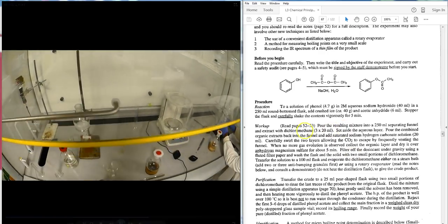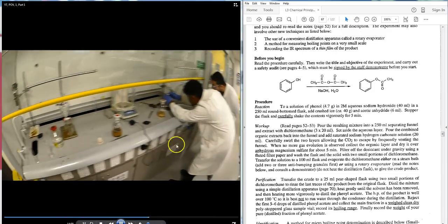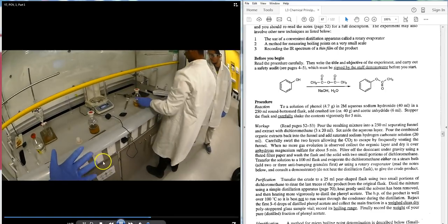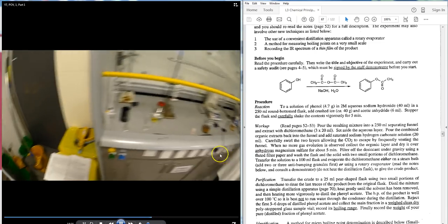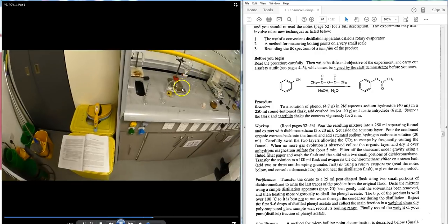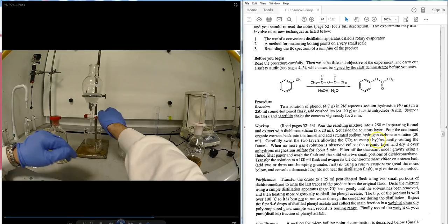DCM is denser than water, so the student needs to collect the bottom DCM layer. The student gets to eye level and collects the bottom DCM layer into an appropriate beaker or Erlenmeyer flask. The top aqueous layer stays in the separatory funnel. This extraction is repeated three times total.